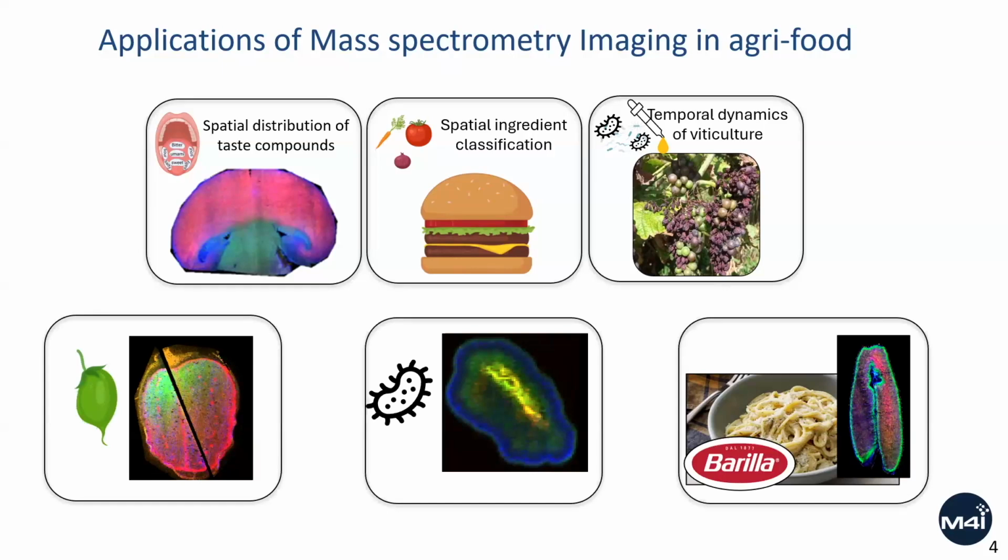And what you see in the corner here is, maybe I'll take out my laser. This is an image of a wheat section. It's a 20 micrometer section, and the green, blue, and red are different lipids in the wheat section.